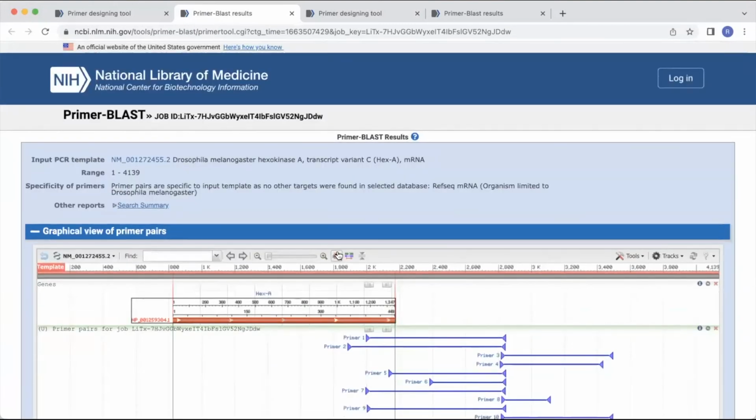Before I end this video, I would like to brief you all about why it is crucial to design a primer. A primer is needed to ensure the efficiency and specificity of the amplification reaction, resulting in a high yield of the desired amplicon. Now there are various other databases with which we can design primers as well, such as RTPrimerDB, PrimerBank, and some software that can help us further, like Primer3 and Primer-BLAST.